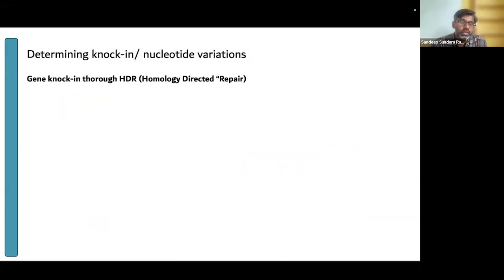We've looked into what happens with non-homologous end joining, and how simple it is to understand what cell lines you're working with, what guide you use, or how efficient it can be. These sequencing runs cost around £2 to £3 per reaction. So if you have a few genes' worth, all this data can be estimated within £10 to £15 worth of sequencing runs. It's not that costly. It's very cost effective. You can use similar freeware tools to understand your knock-in as well.